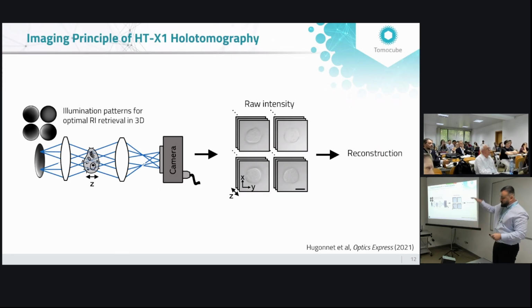But the way we do it, we're using something called a digital micromirror device. So we're using a DMD with small mirrors where we can just change the angle of the light as we want. Then we do multiple patterns in a single slice, and then we do slices through. The patterns that you see there are literally the patterns. We do four patterns in each slice, slicing through from 0 to 150 microns in the depth of the field of view.